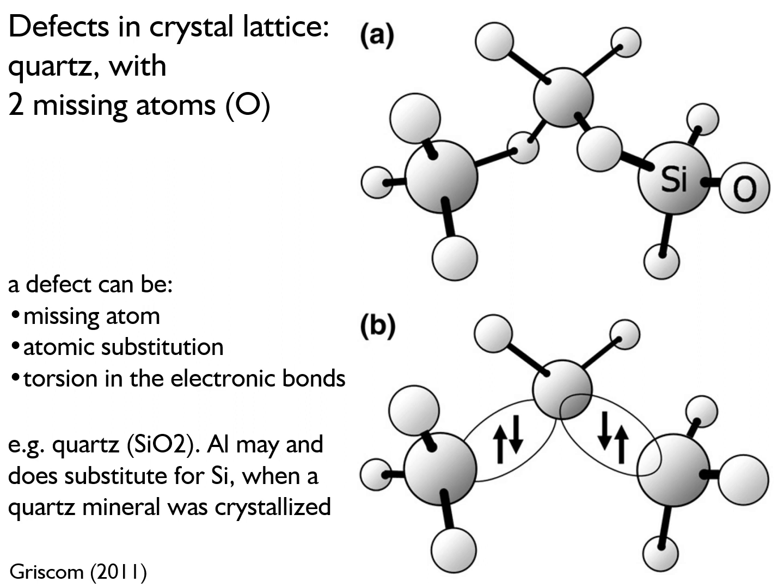A fun fact: if you take pure quartz, with no defect in it, in the environment, we find these in a hydrothermal quartz vein. They will display zero luminescence signal.